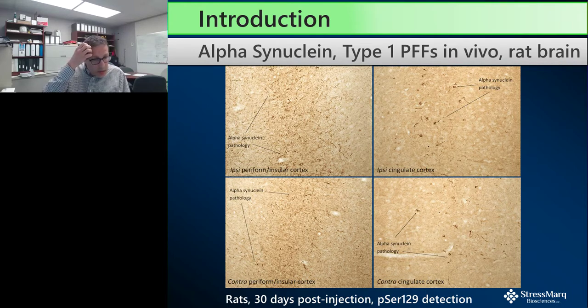And this is, of course, of critical importance because for those that are wanting to try treatments or drug regimens to attenuate the process of aggregation and the evolution of this pathology, you have to create the model in order to test those methods or candidates. And I think in this case, the time that is used for this experiment is only 30 days. So it's a very fast way of generating the model, whereas if you were to use transgenic animals, for instance, this could take many months.